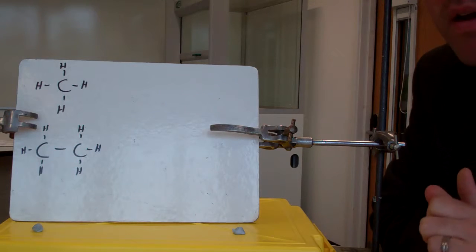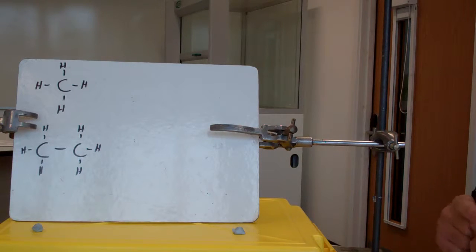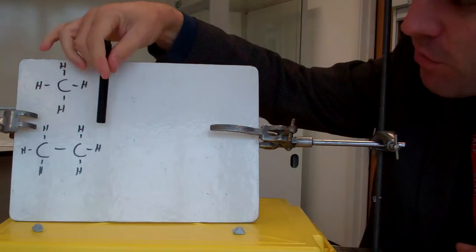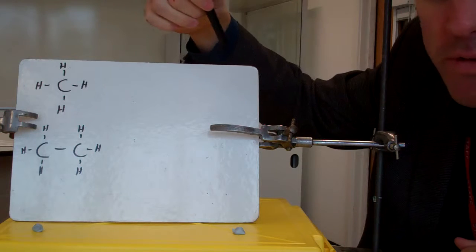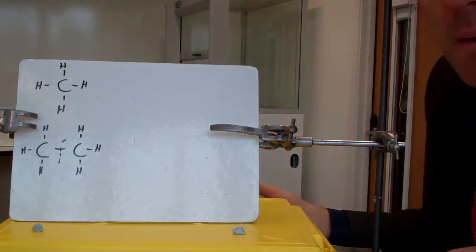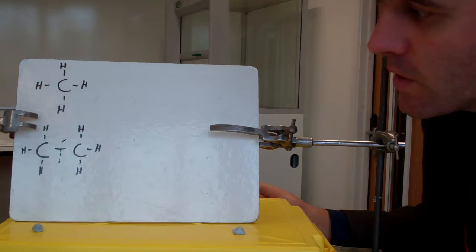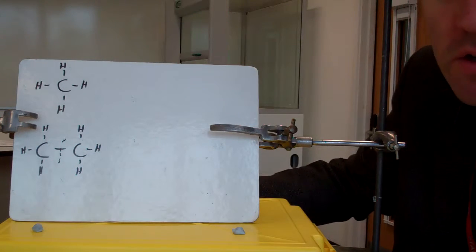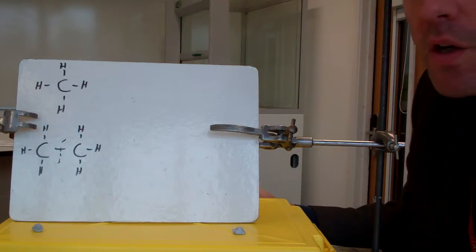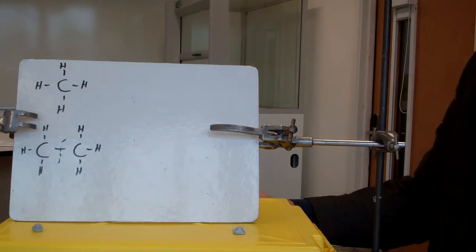Okay, so if we start reasonably simple, here we've got methane. Each one of those hydrogens in methane is in the same environment, so that would just have one peak. We look at this one here, this is ethane, CH3, CH3. Those two CH3 groups are equivalent to each other. There's a line of symmetry running down this molecule. So if I turn the molecule around, it would still be CH3, CH3. So again, this only has one hydrogen environment. So both these molecules have one hydrogen environment. It's only one peak on a hydrogen NMR graph.